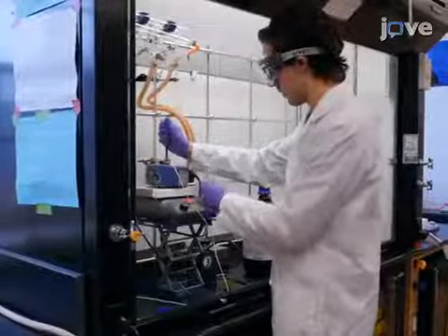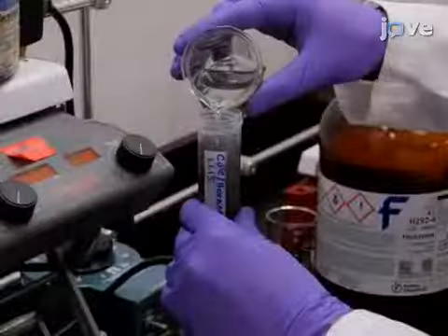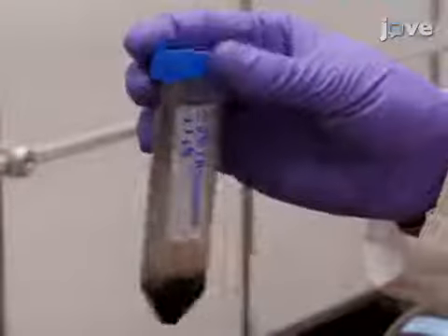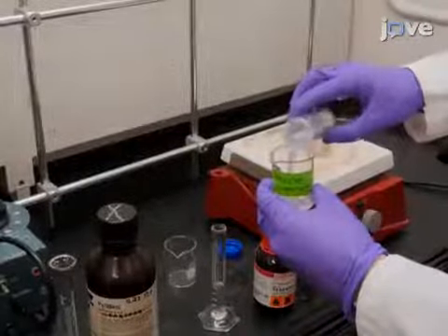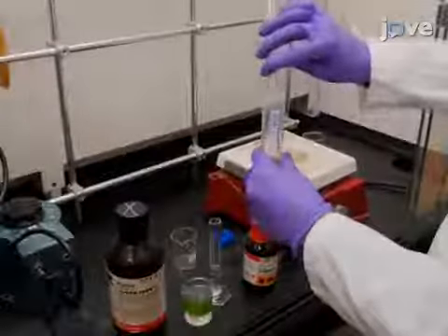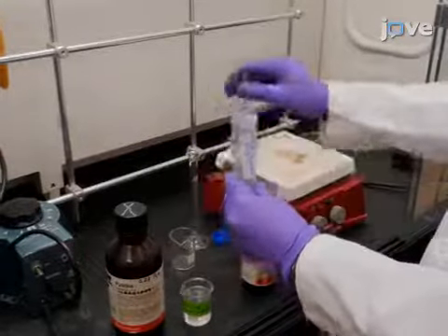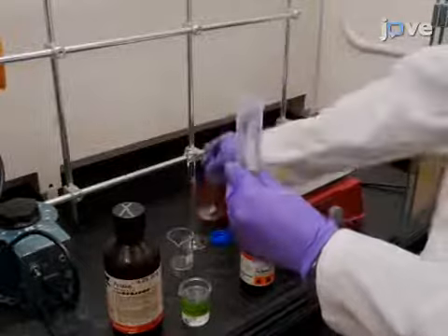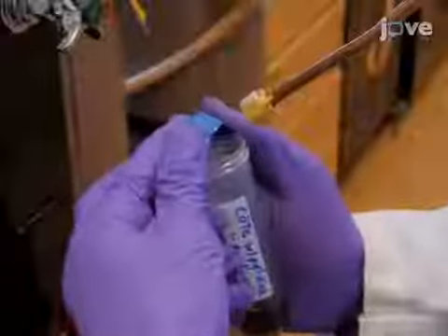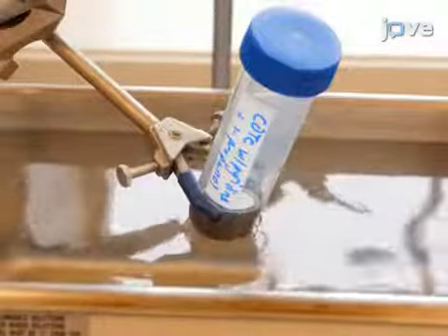When synthesizing the cadmium selenide and cadmium telluride inks, follow the text protocol up to the pyridine synthesis step. Decant the supernatant and add back 5 ml of distilled pyridine and 5 ml of 1-propanol. Then, flush the flask with an inert gas and sonicate the mixture at 40 kHz for 30 minutes.